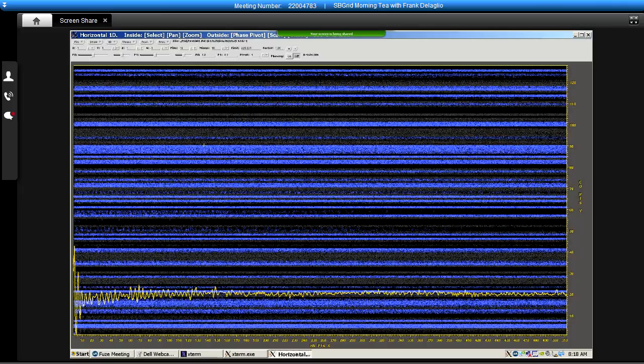And when a particular graphical mode is turned on in the NMRDraw program, the topmost border of the program tells us what the different mouse buttons do. And depending on whether the mouse pointer is inside this spectral graphics area or outside in the borders where the axis is drawn, the buttons of the mouse can potentially do different functions.